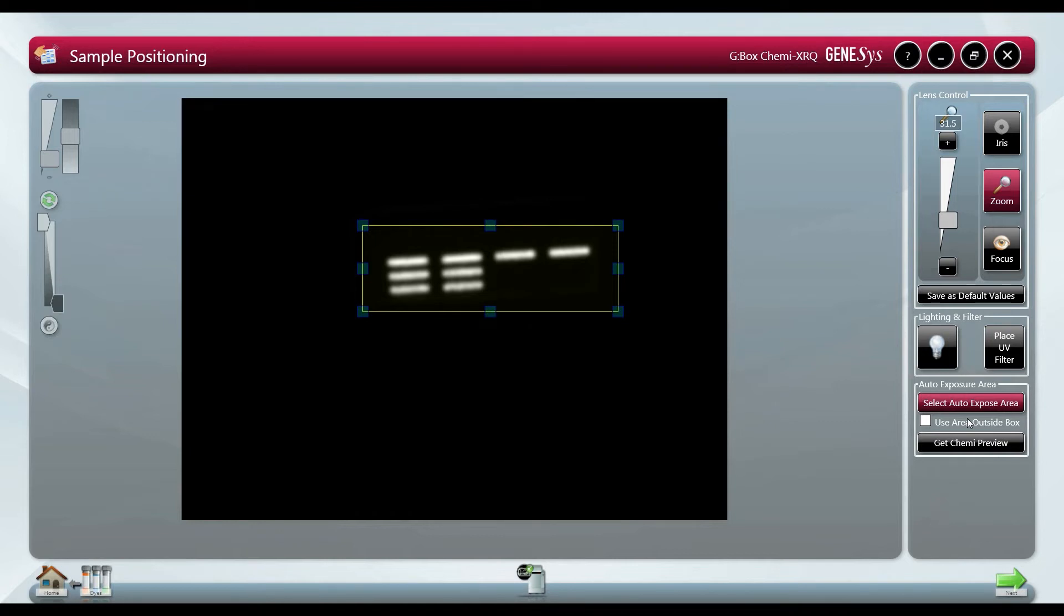We can either select the faint bands to optimize the signal they produce or we can select the area outside of the bands to ensure the faint ones show up.